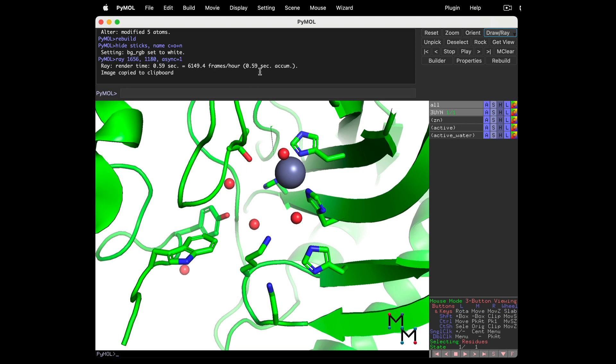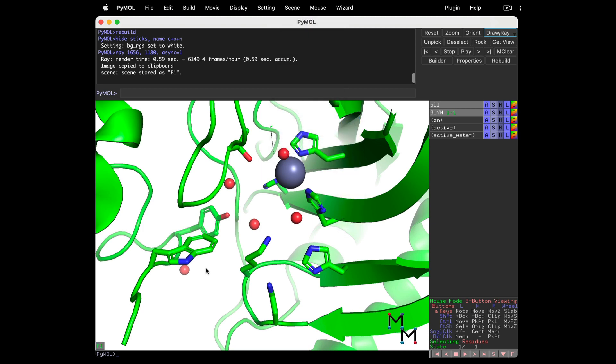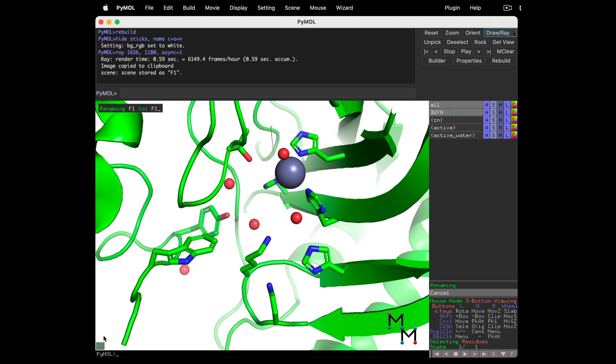Go to the drop-down Scene Menu, Store, select F1. The scene appears in the bottom left of the Structure Viewer window. Right-click and rename to give your scene a more memorable name. The old scene name appears in the upper left-hand side of the Structure Viewer window. Delete that, and let's call this Active Site.